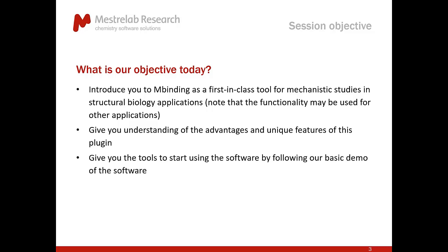Okay, so the format is the same as for a couple of the last sessions that we did. I'll do an introduction for about 15 minutes, and then Pablo will give us a demo that you can follow with the software licenses and sample data that you should have been sent prior to this webinar. We talked to Pablo after the session yesterday and asked him to go a little more slowly, so hopefully everybody can follow. Of course, if you still find it quick or you get lost along the way, we will share the recording of this webinar in the next 24 hours or so, and you will be able to practice at home.